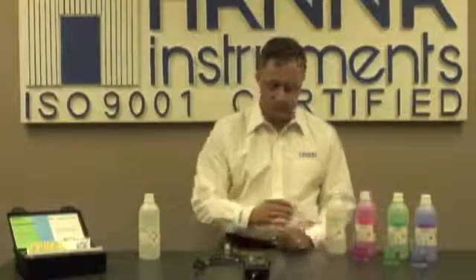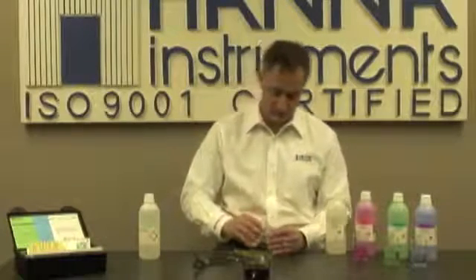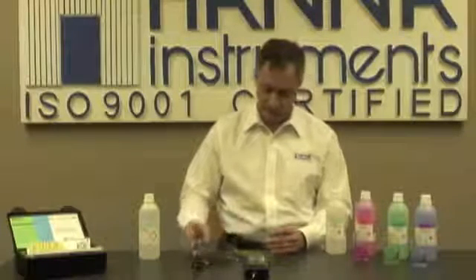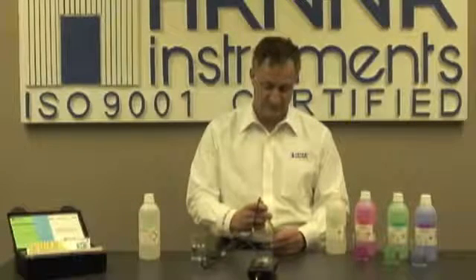One final tip: before you put your meter away, it's very important to keep your probe conditioned. I like to take a little bit of storage solution, pour a little bit into the cap, and put the cap back on the electrode — and it's good to go for the next time.